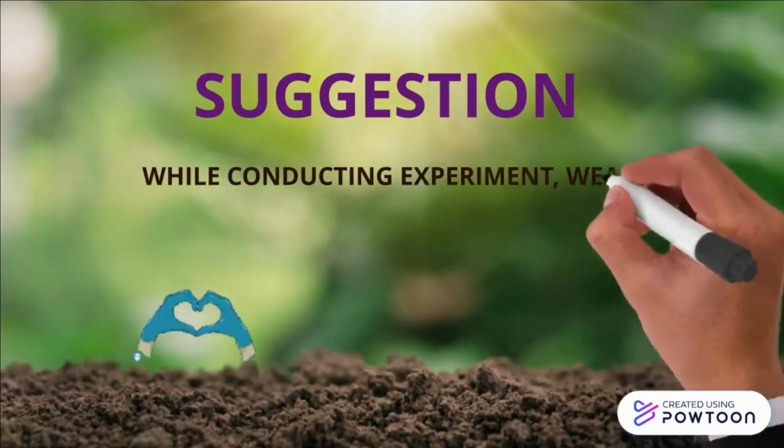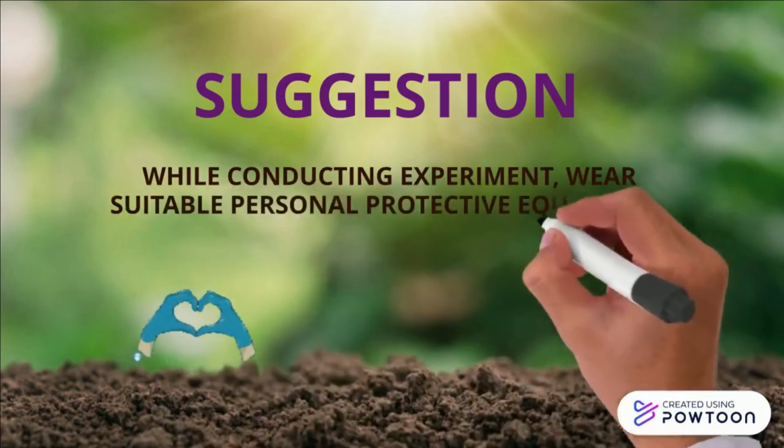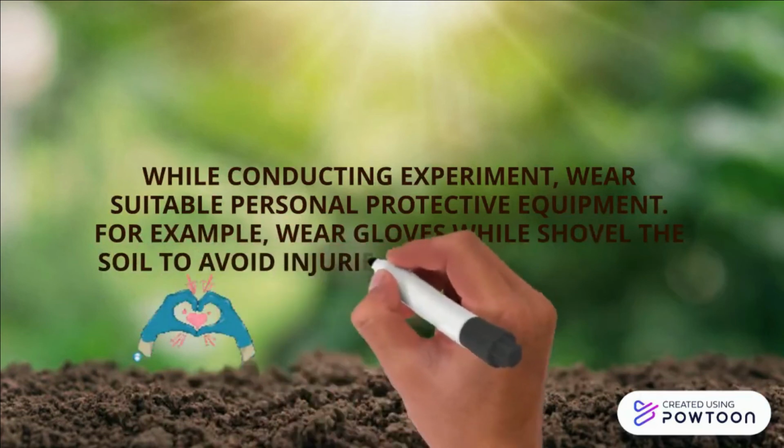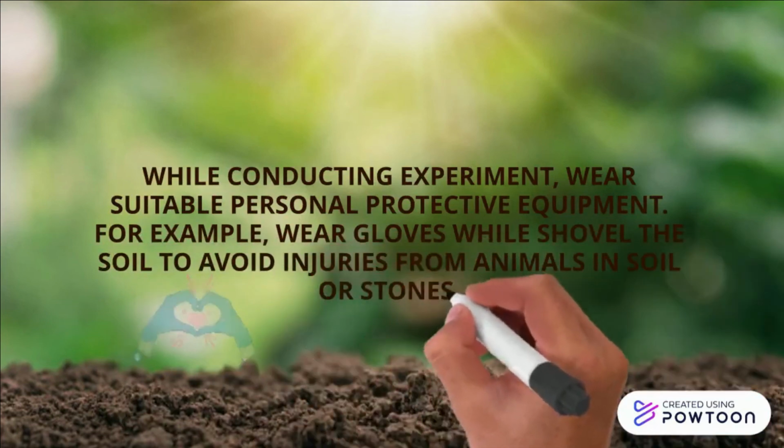While conducting the experiment, wear suitable personal protective equipment. For example, wear gloves while shoveling the soil to avoid injuries from animals in the soil or stones.